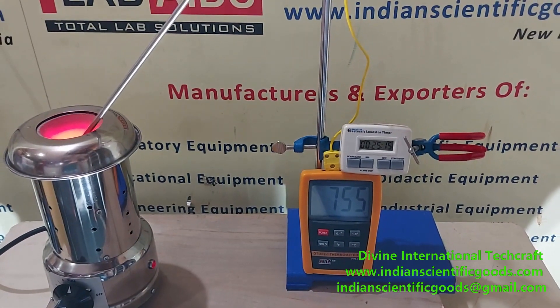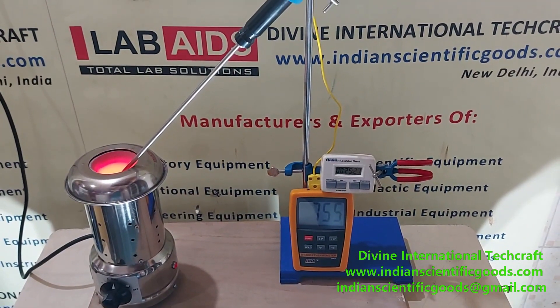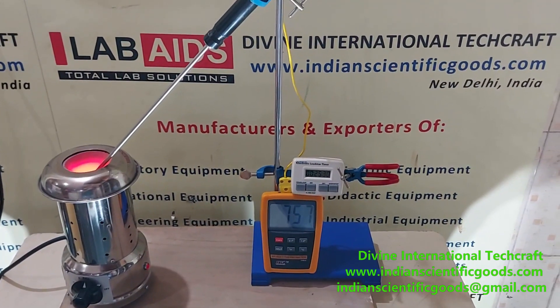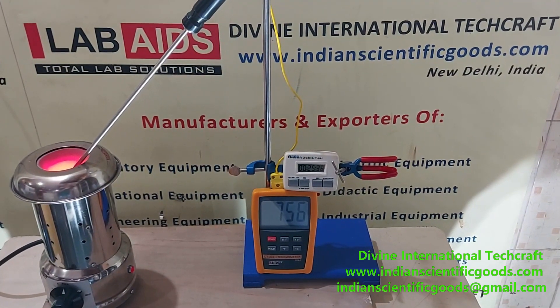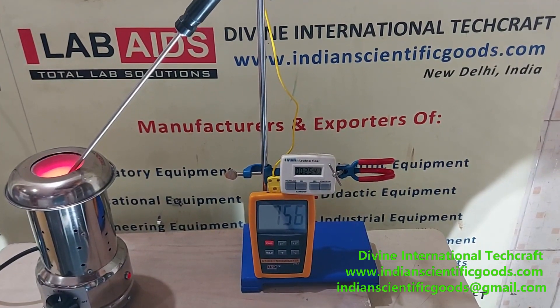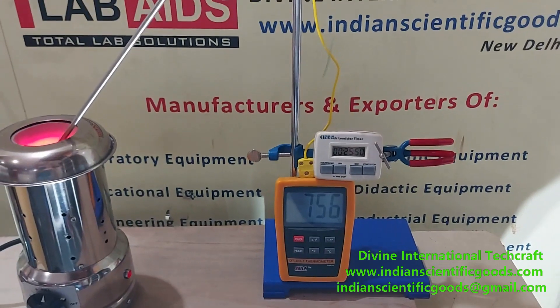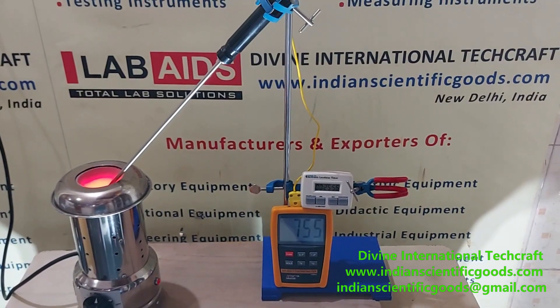The maximum temperature that can be achieved by this electric Bunsen burner is about 800 degrees centigrade. We will now be stopping this experiment here. The temperature has been reached in 25 minutes — in less than half an hour, the temperature can go to 780 degrees centigrade.